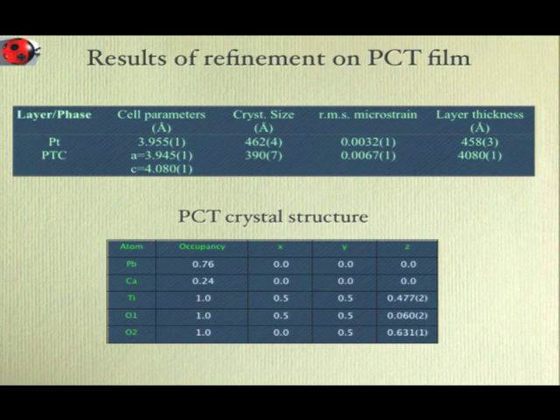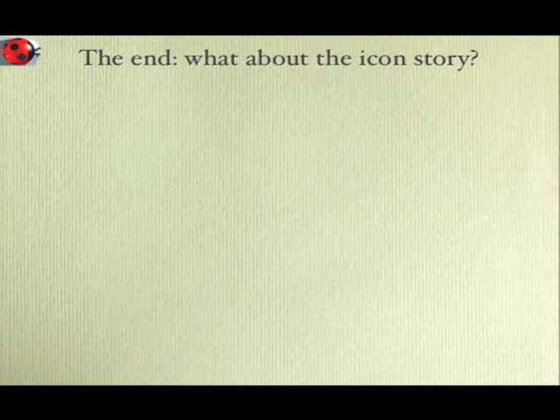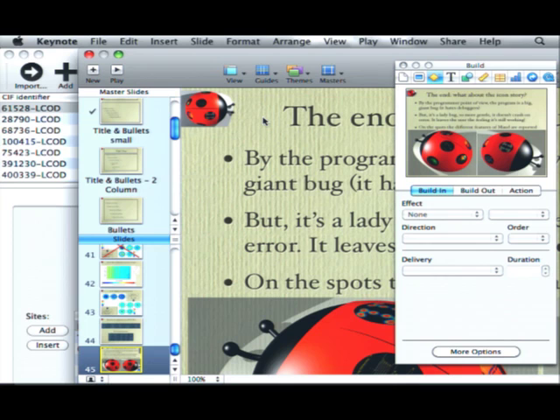And also what the good thing with MAUD, as I said, we combine microstructure, crystal structure, and all the features, so we can refine film thickness, like there, and we got nearly right, and also the crystal structure. That is, we don't need this one.